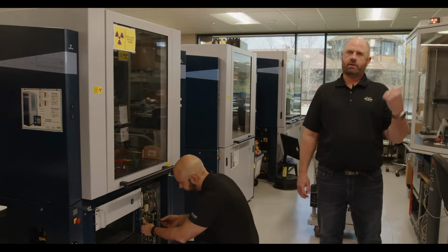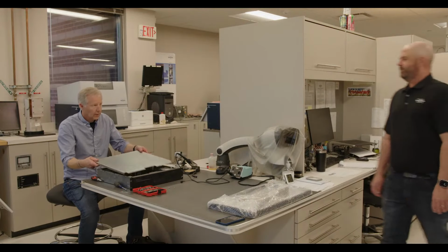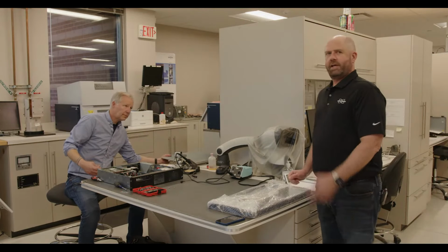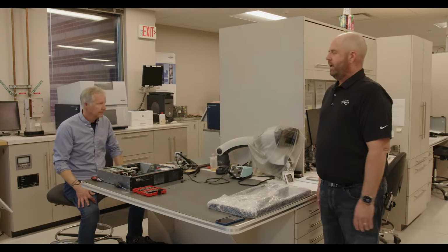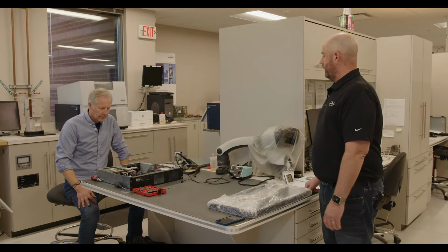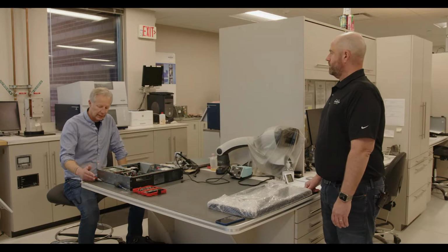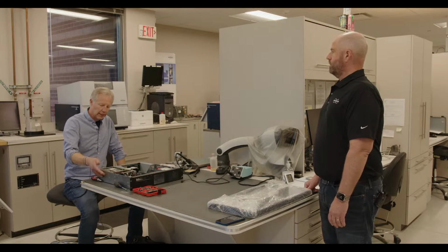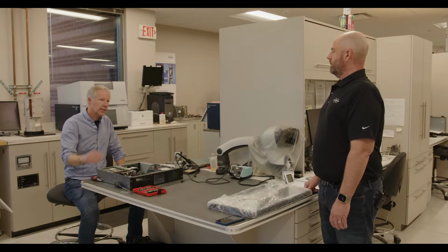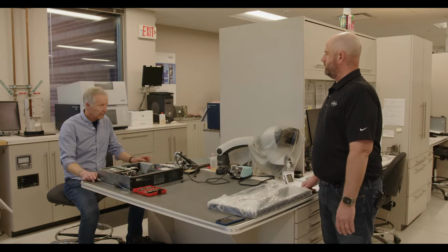So why don't we head over to the depot repair, which is also part of this system. Hey, Todd. Hey, Sean, how you doing? Good. This is Todd Larson. He's part of our single crystal group, and this is our depot repair center. So, Todd, looks like you're working on an ICS. Yeah, today I'm working on an ICS for a Photon 2 or Photon 3 detector. I'm going to replace the board and the fan in there. Then it'll go to our test station, and we'll turn around and get it out to the customer. Okay, so that's customer property that was RMA'd in?